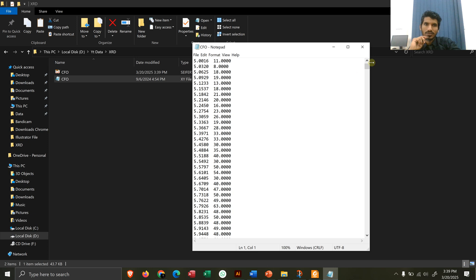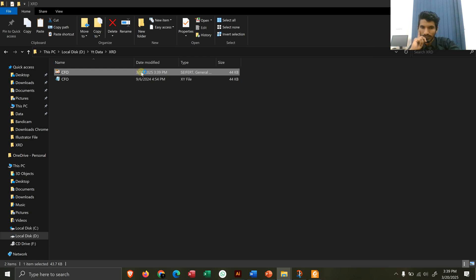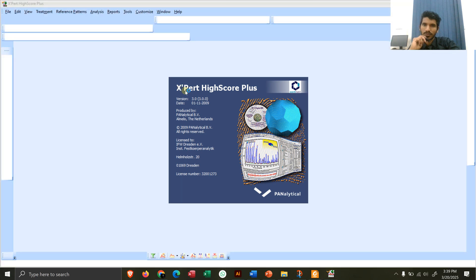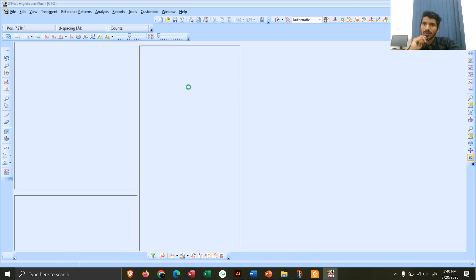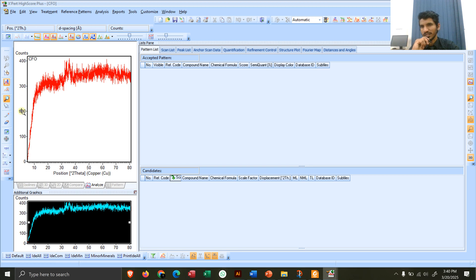After clicking Save, you can see we have another file — this is the HighScore Plus file. Double-click to open it. As you can see, the file has been opened in HighScore Plus. Here is your XRD pattern, here is the intensity, and here are the two-theta values.